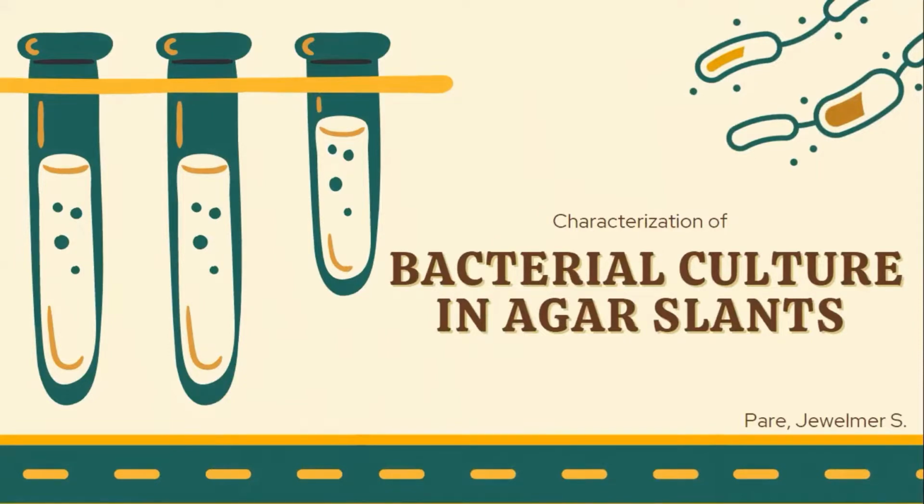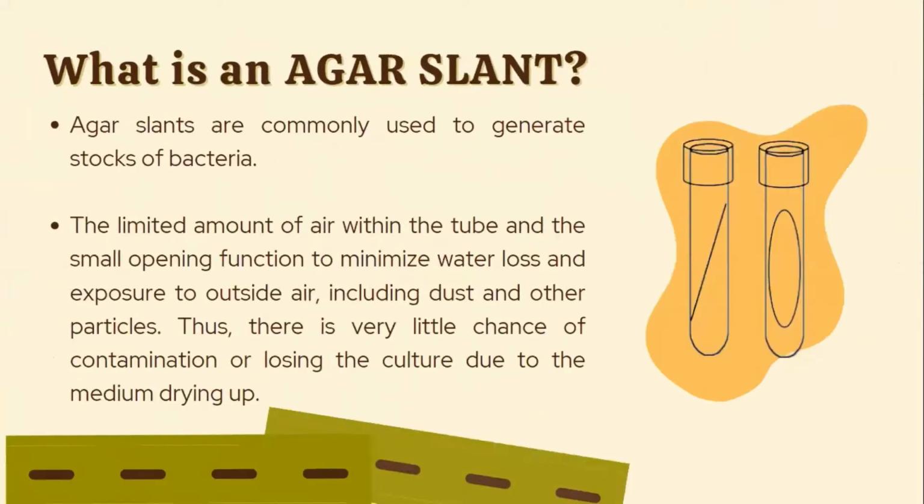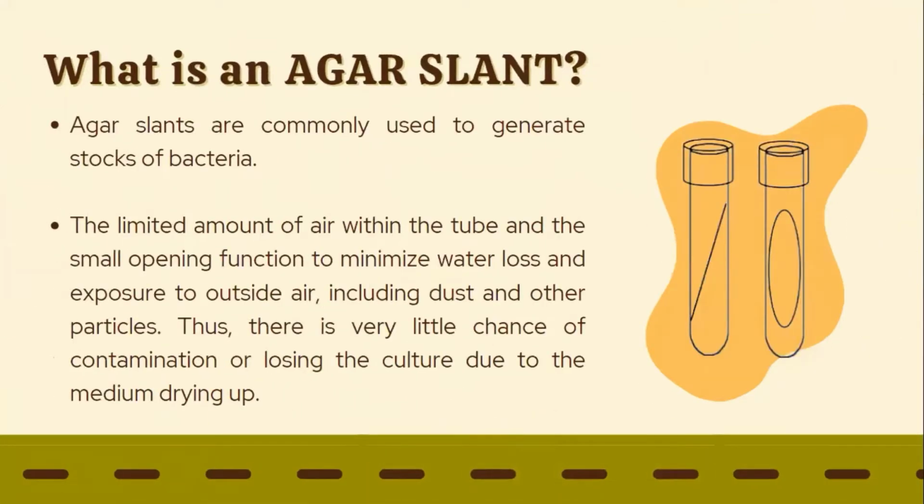I'm Jewel Marisupan-Pare, and I will present to you the characterization of bacterial culture in agar slants. Before anything else, let us first define agar slant. Agar slants are commonly used to generate stocks of bacteria.